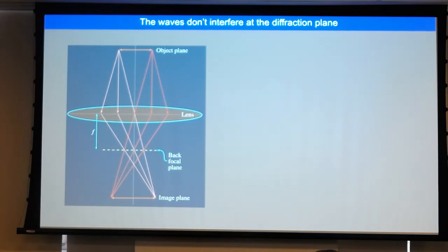So that's the changing of color that you are talking about? Say again? The changing of color you are talking about is a change of phase. Yeah. So that's why we are not seeing it, because we are recording only the intensity. That's correct.